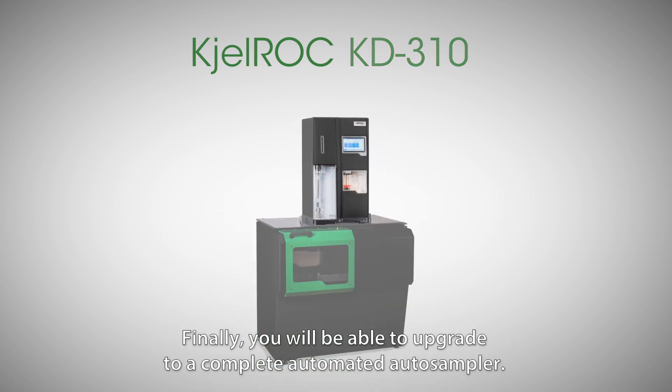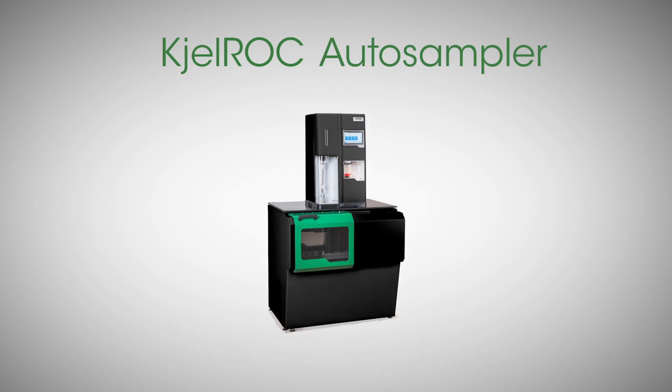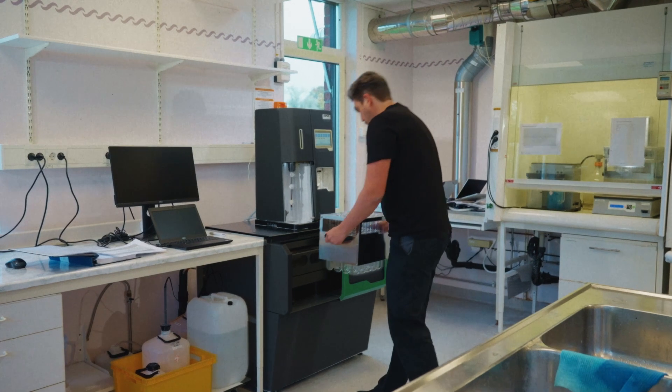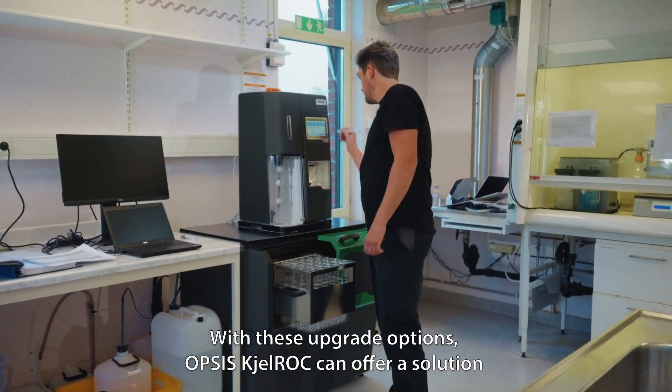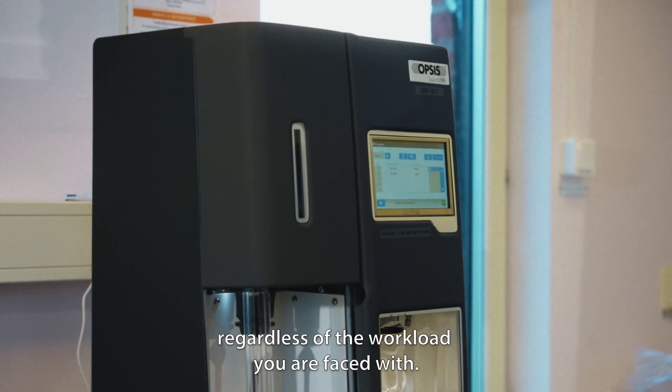Finally, you will be able to upgrade to a complete automated Auto Sampler. This upgrade path makes it possible to scale to match your laboratory's workload. With these upgrade options, Opsys Shellrock can offer a solution regardless of the workload you are faced with.